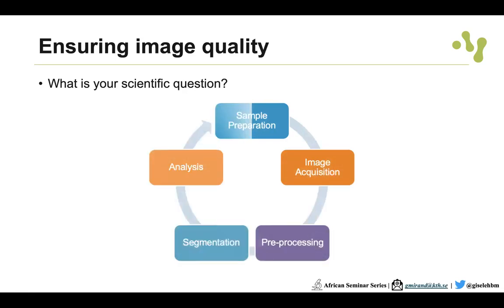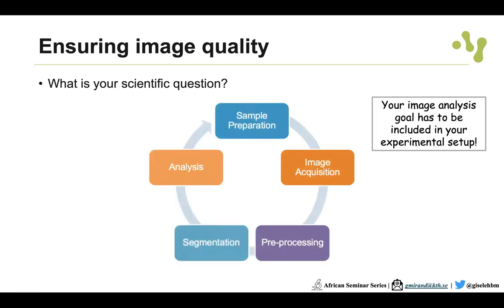It's good to keep in mind that your image analysis goals have to be included in your experimental setup, going from sample preparation until the analysis. So how you can optimize your sample preparation to also get the optimal analysis.